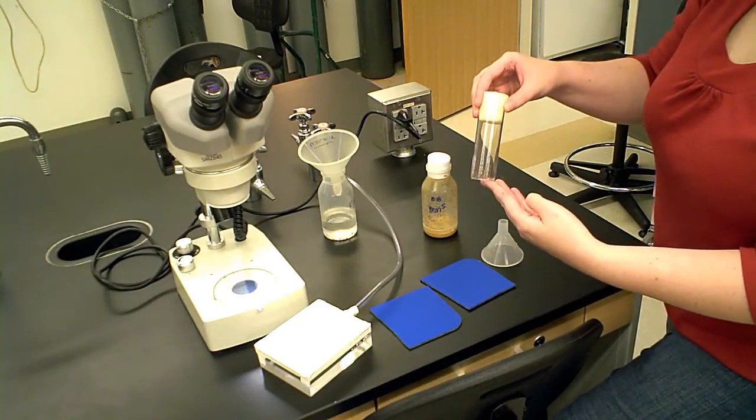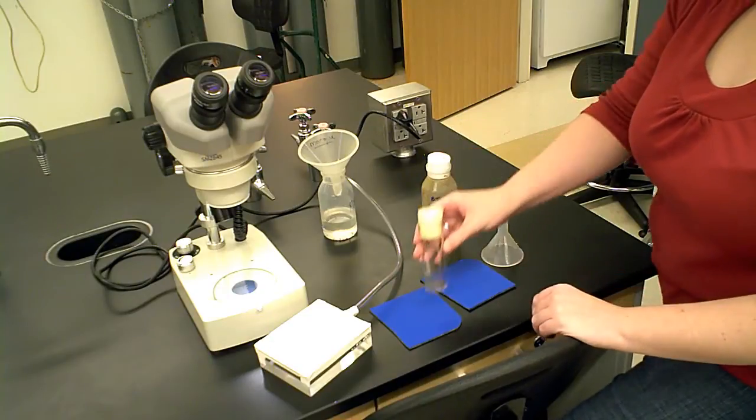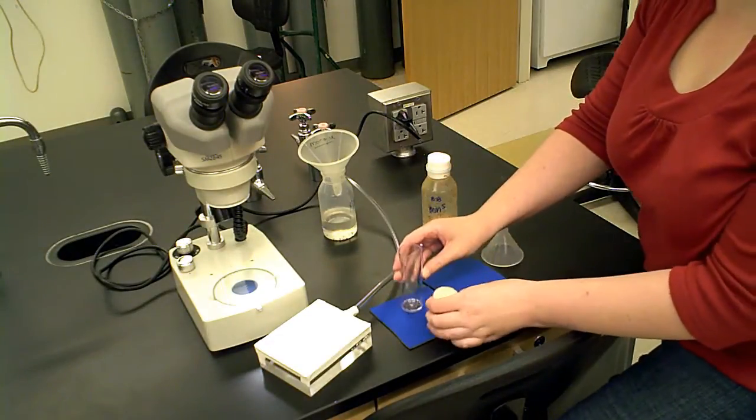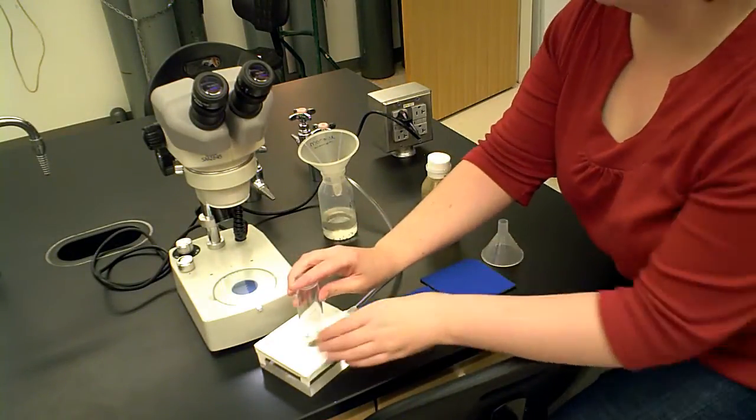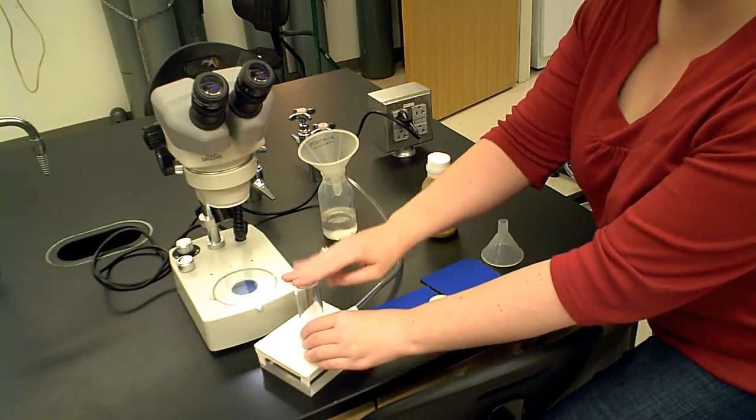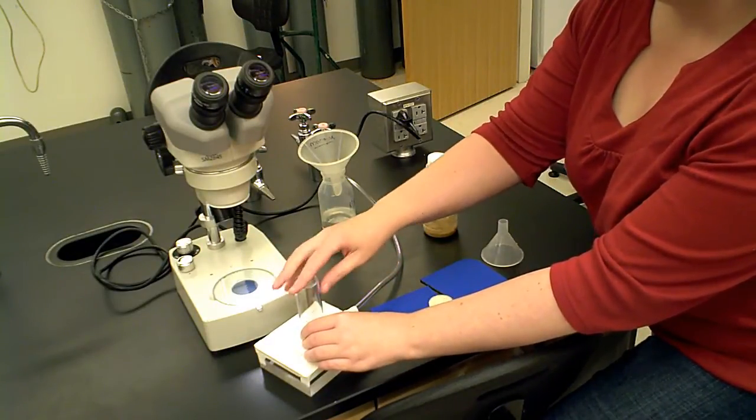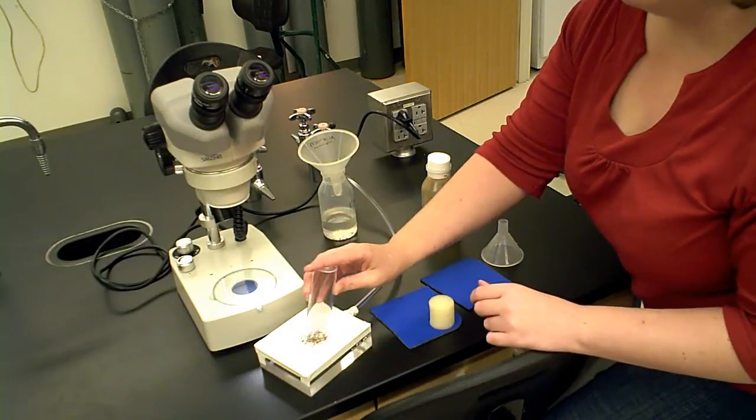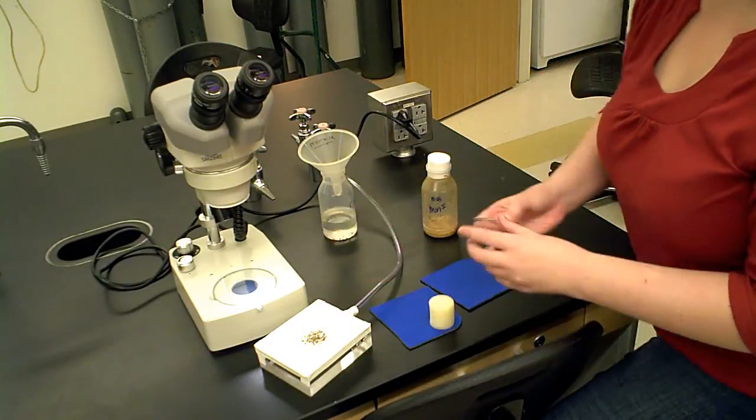Here you have a holding vial worth of flies. If you'd like to gas them on the CO2, lightly tap them down and quickly turn them over onto the CO2 pad with the CO2 already running. Gently tap them until the CO2 has knocked them unconscious.